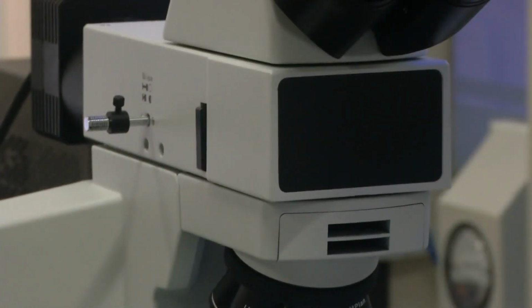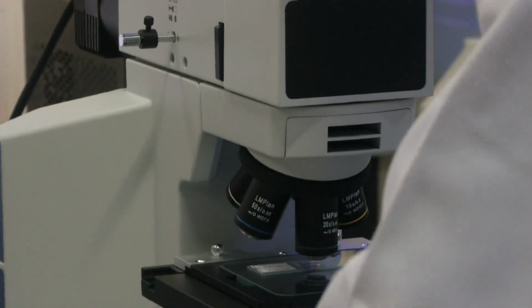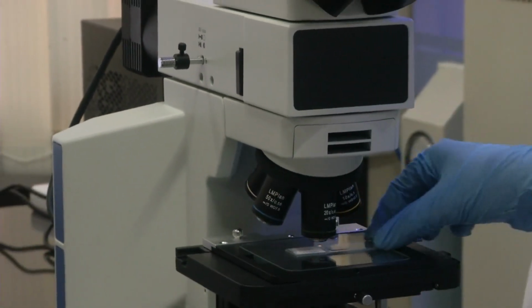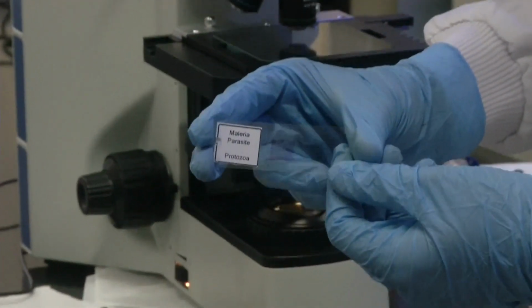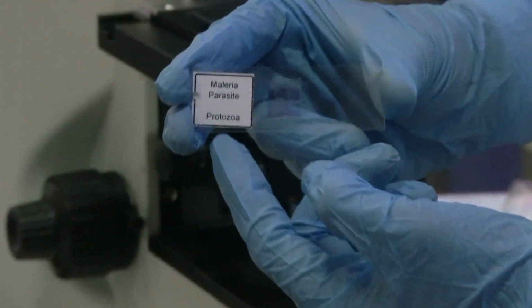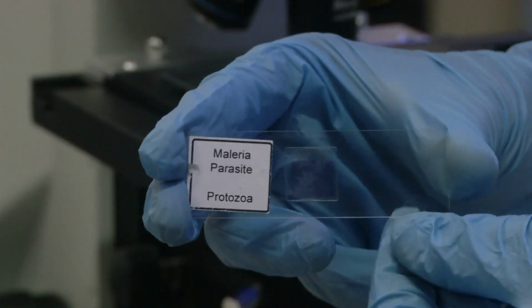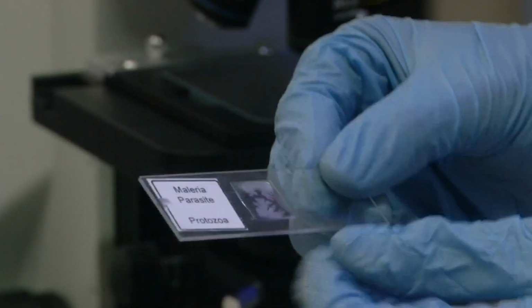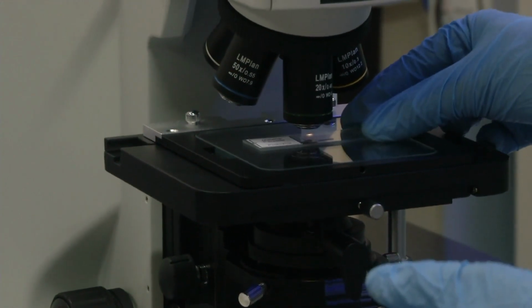Okay. Today I have taken one sample from here, and that is inactivated malarial parasite, because all of you are aware of malaria disease. So, I thought we will show you the malarial parasite. This is inactivated, nothing to worry about, you will not get any disease with this, but you have to always take precautions because you are handling biology related topics.